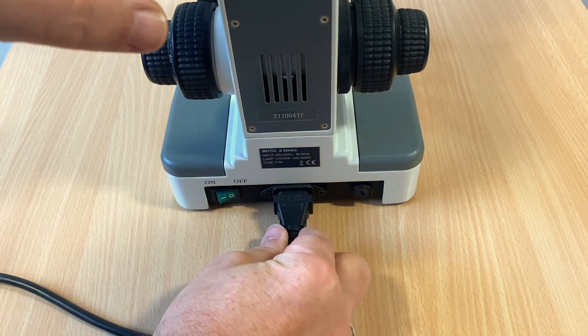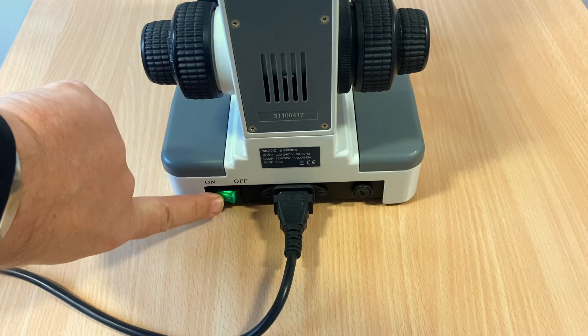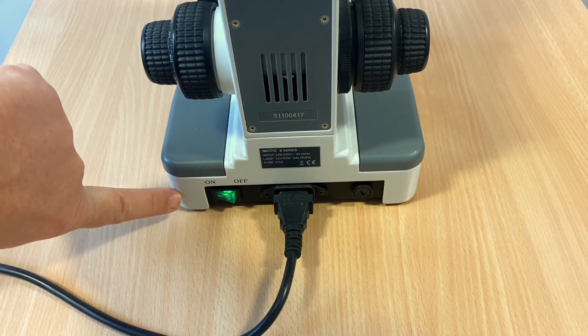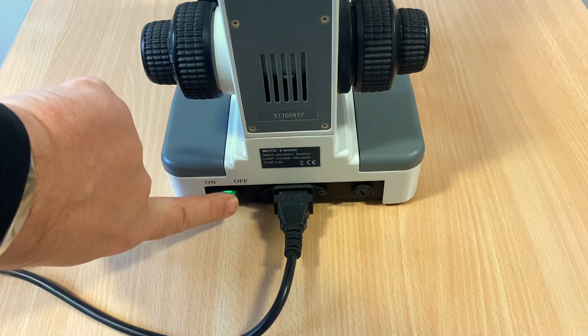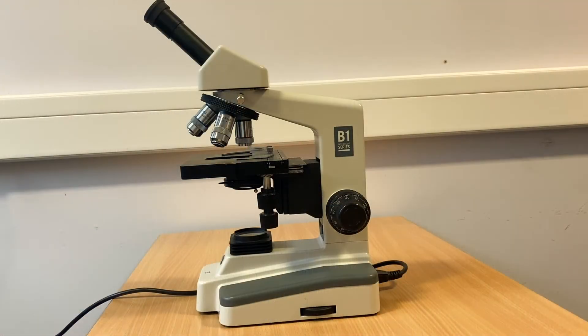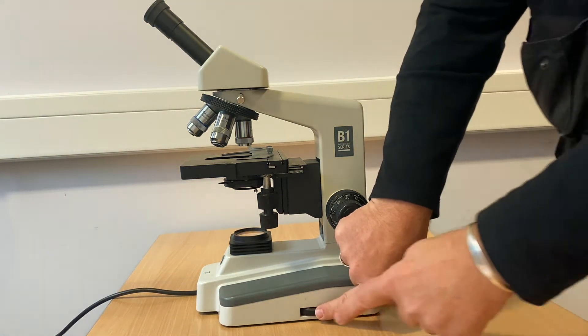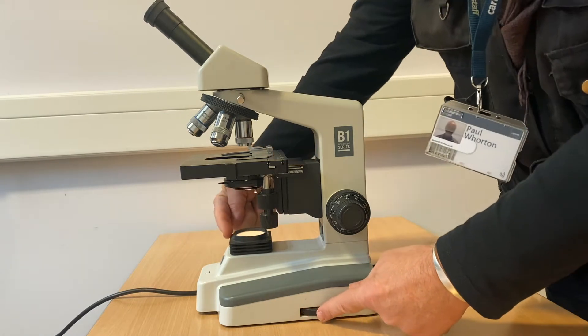Always check the power cord is inserted properly and the device is turned on. On this particular model of microscope, the Motic B1, the light intensity is controlled by the wheel on the base.